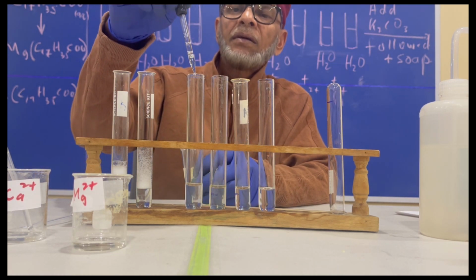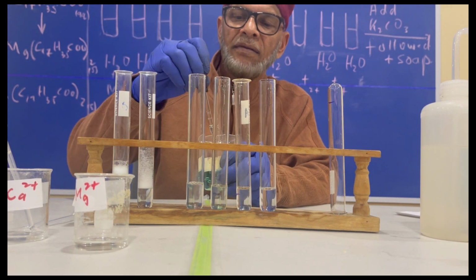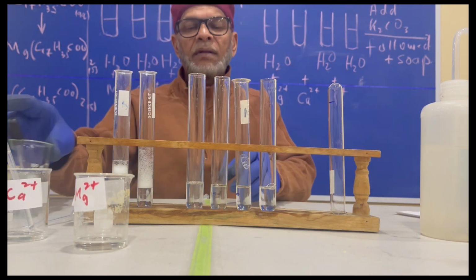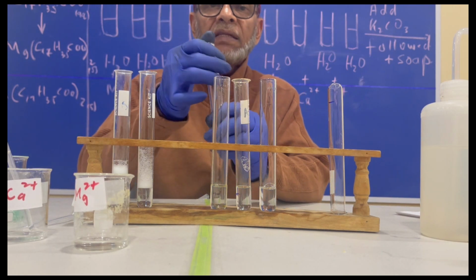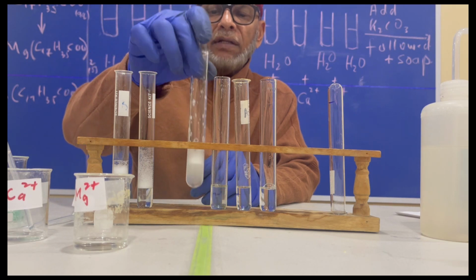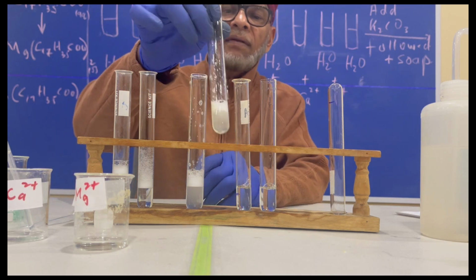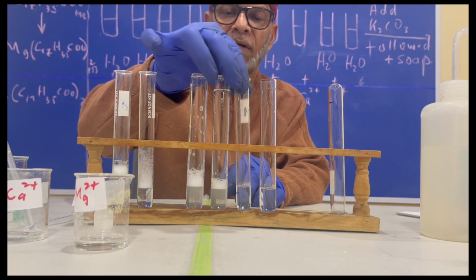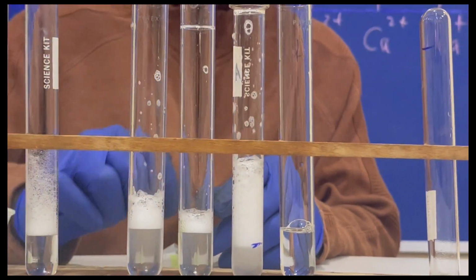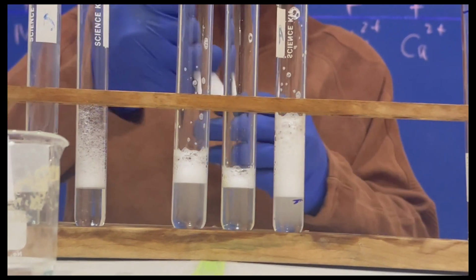That amount there. First one, same. Second one, same volume there. Third one, same volume there. Fourth one, distilled water. We'll now shake these up and then see the degree of lathering. That is what it is for the one that contains magnesium ions. That is it for the one that contains calcium ions. That is what it looks like for the one that had sodium ions. And this is the one without anything, distilled water.